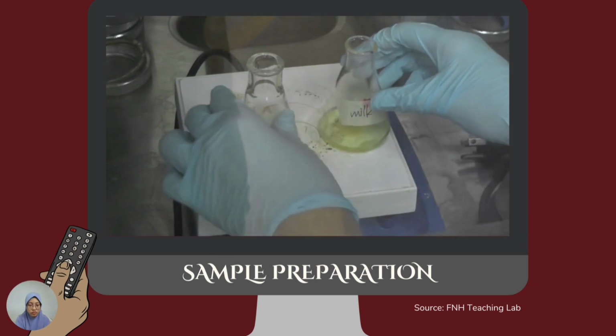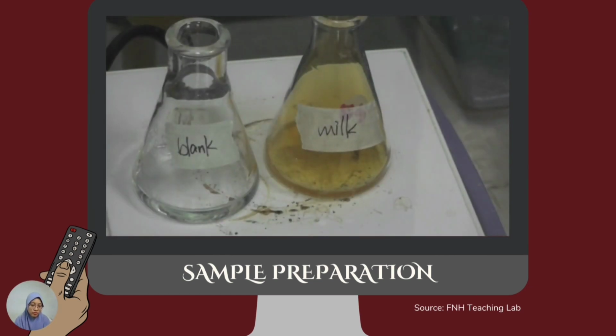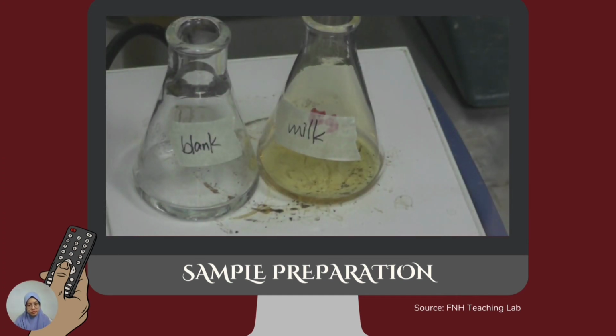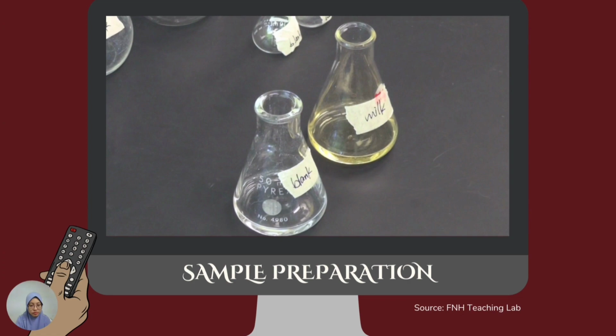Set up the hot plate in the fume hood and heat the flasks at medium heat. Swirl occasionally. Your solution should change from cloudy to dark orange brown to clear pale, while your blank should stay clear. If your solution is still orange brown after 20 minutes, add an extra 2.5 milliliters of nitric acid and 0.5 milliliter of 30% H2O2 and continue to heat. It is possible to obtain a clear yellow solution if you put in an excess amount of nitric acid, but it does not affect the result.